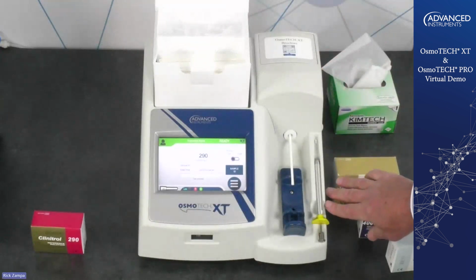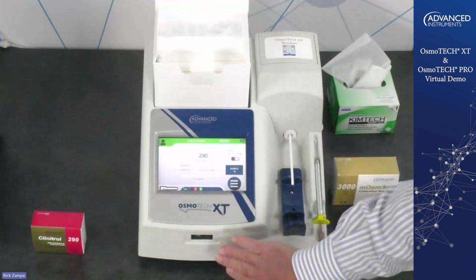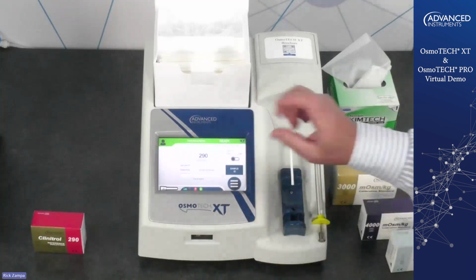Over here on the side, we have our sampler, which is used for the tests, and then our carriage and our cooling assembly entry here. It has a built-in barcode scanner on the front. And let me see if that's everything I need to talk about right now. Yes, I think it is.